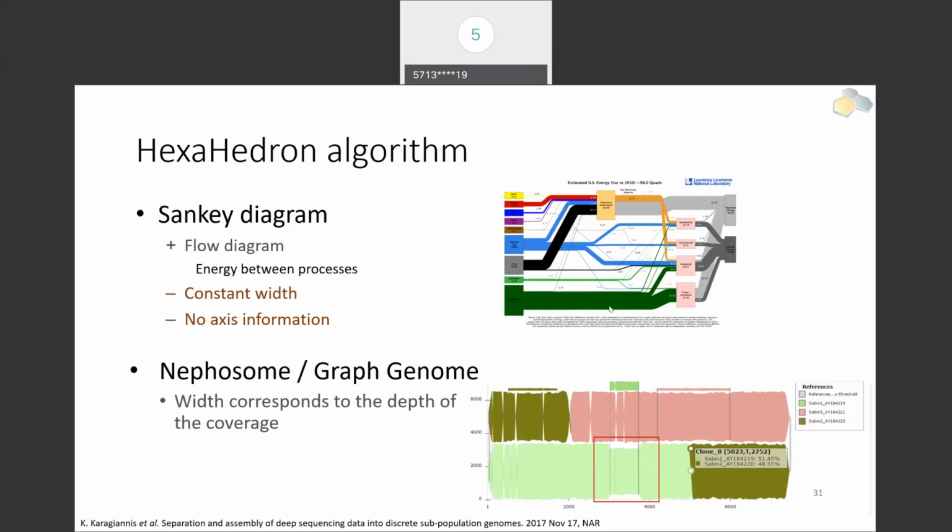It's slightly different from the Sankey diagrams, but they're similar. You can see the width here represents the depth of coverage at each given position of the strain of the quasispecies population that we described, and the bifurcations, small branches that come out and then back into the original clone. This is practically a way of reading the different species, the quasispecies, that we observe in the sample.